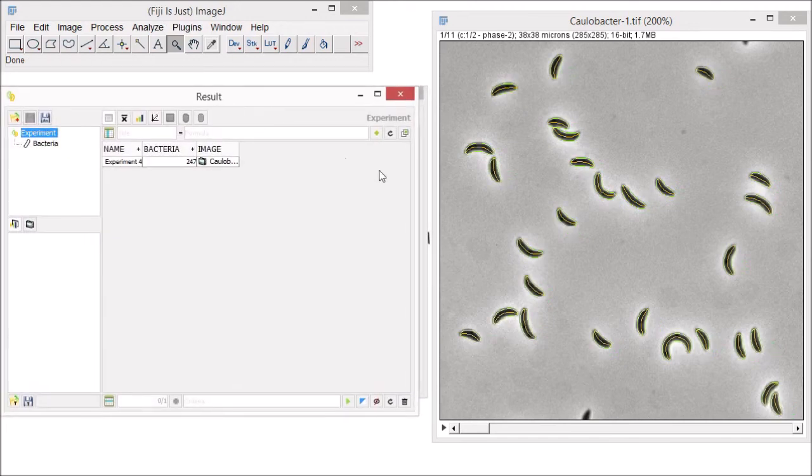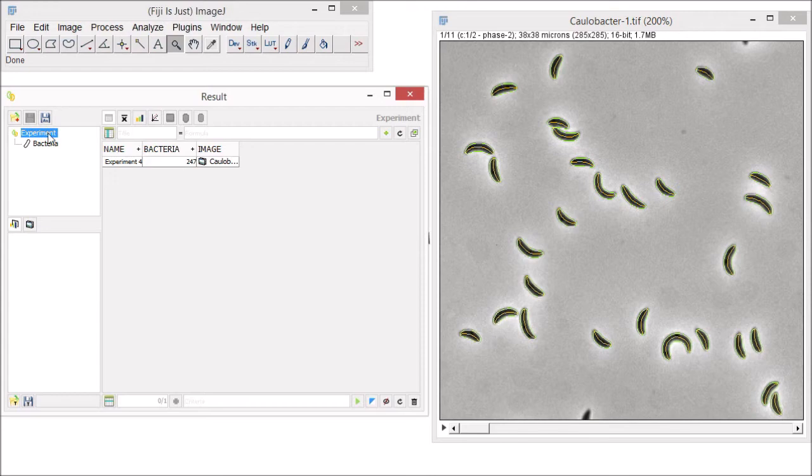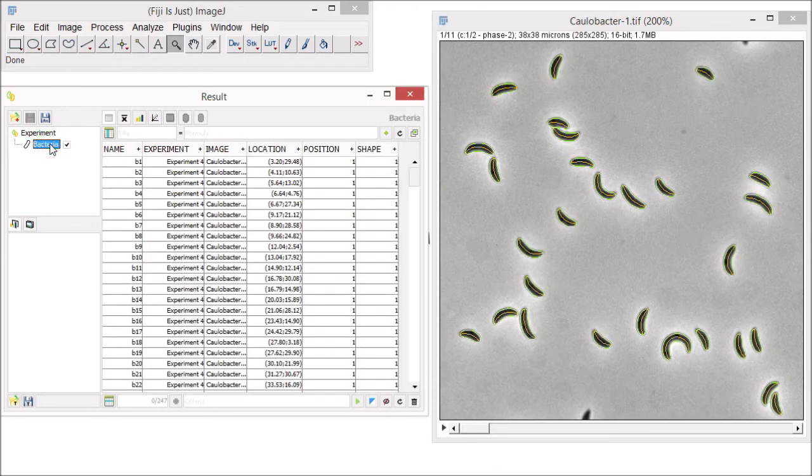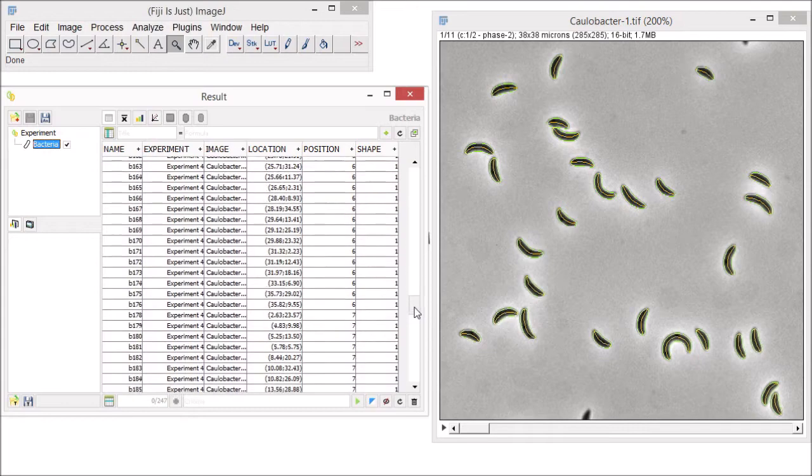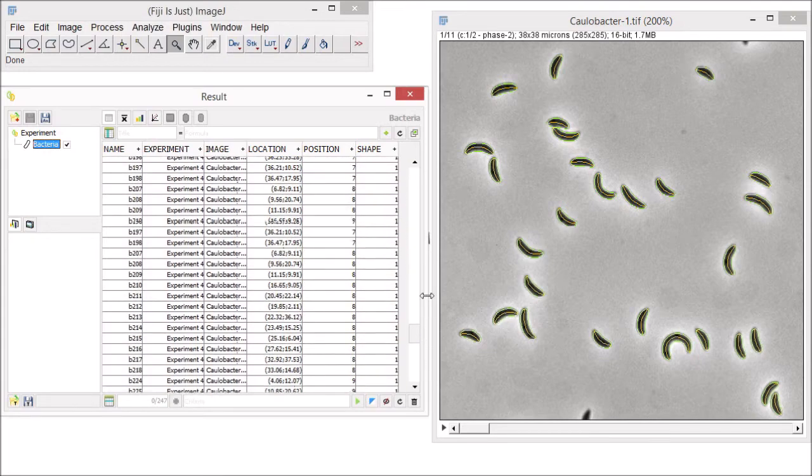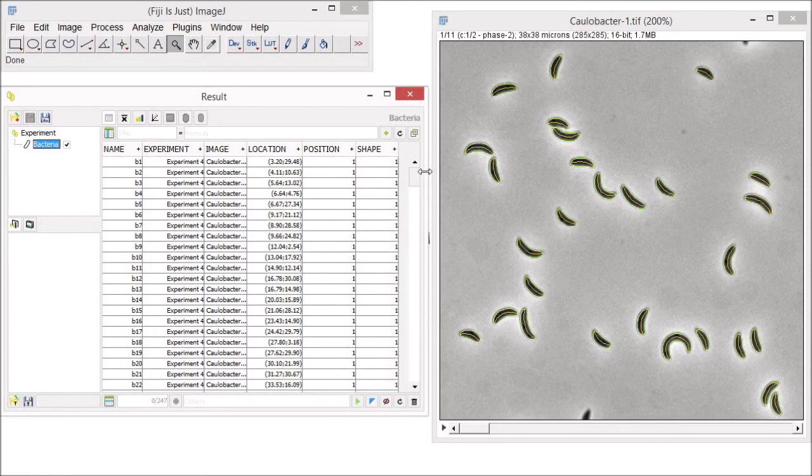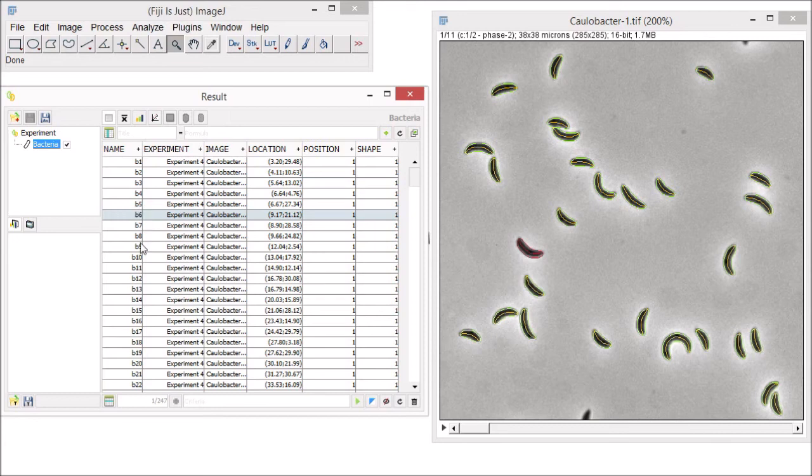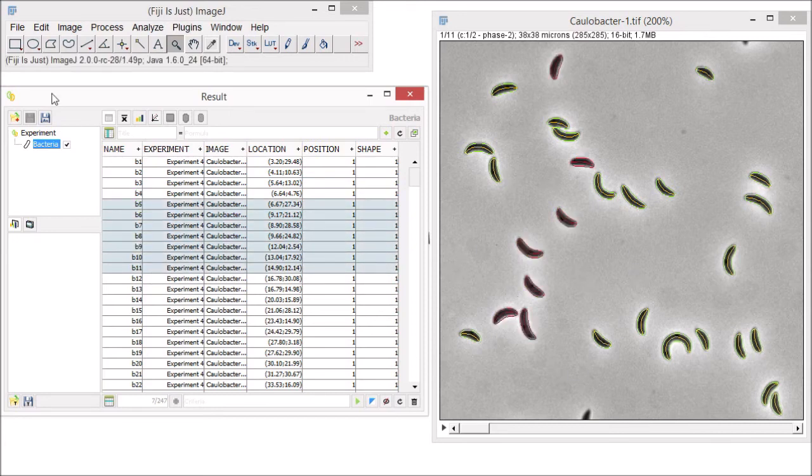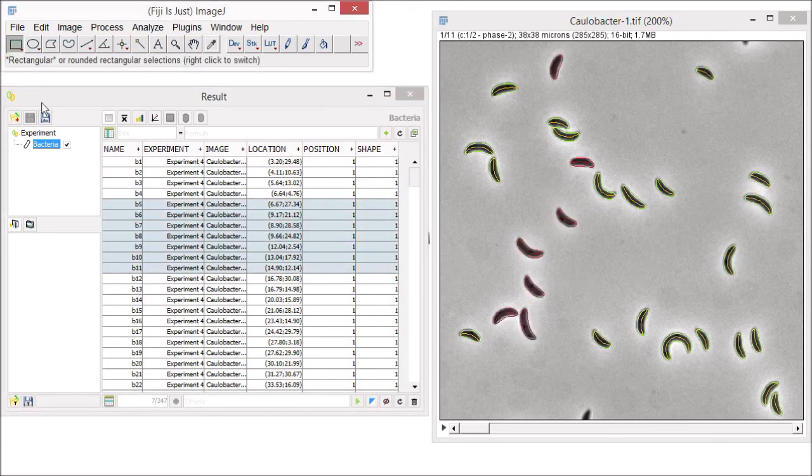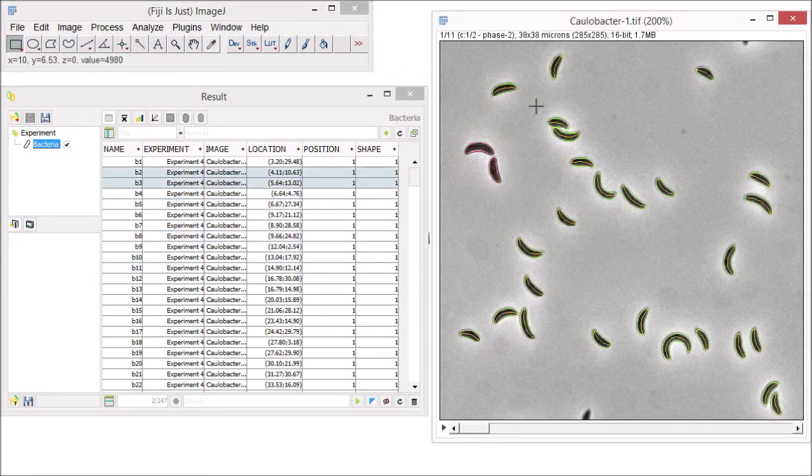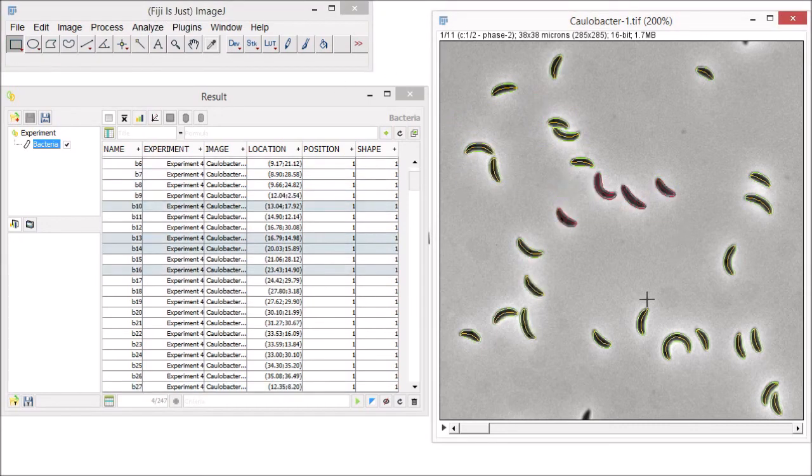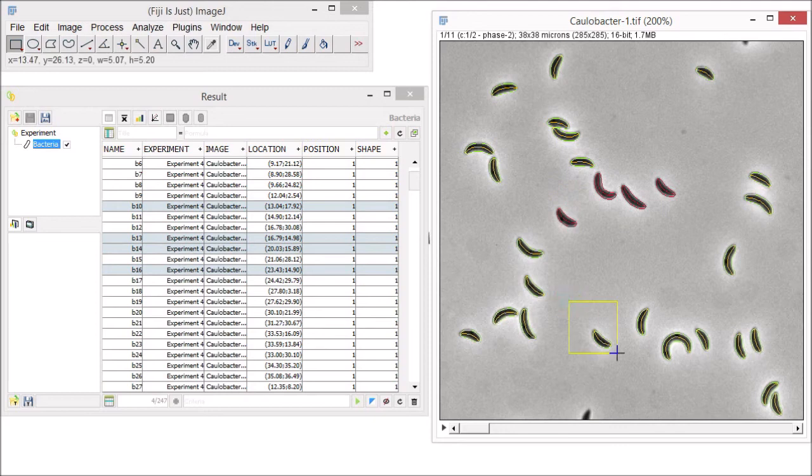The results interface combines all the information about the experiment and the bacteria that MicrobJ has detected. To get access to any information associated with the bacteria, just click on Bacteria here on the left panel, and you will see all the bacteria detected in that image on the right panel. Each row is an individual bacterium detected in the image and is directly linked to the image. So if you click on one row, it will highlight the corresponding bacteria detected on the image, and likewise, if you select a bacterium on the image, it will highlight the corresponding row of the list.